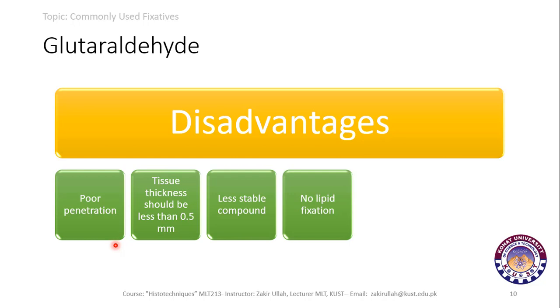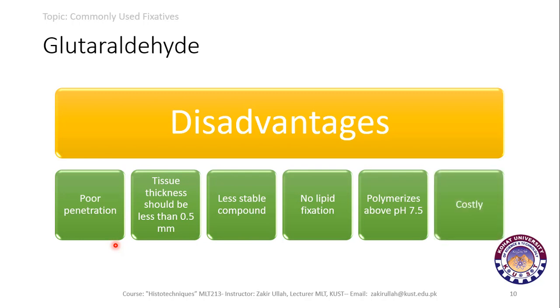It does not fix any type of lipids, and glutaraldehyde polymerizes above pH of 7.5. And the last one is that glutaraldehyde is costly as compared to the formaldehyde.